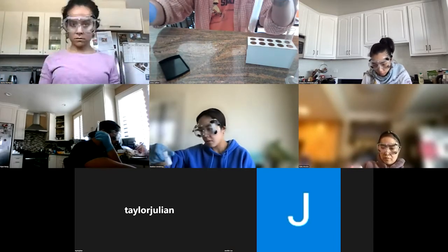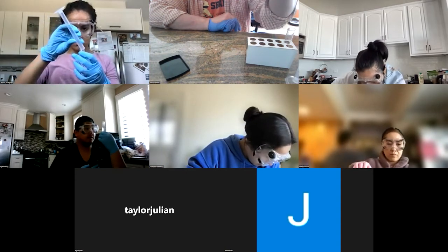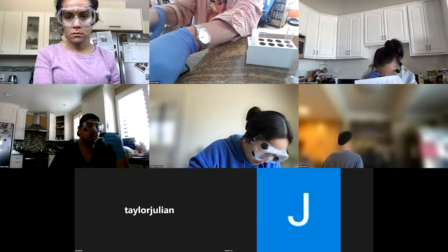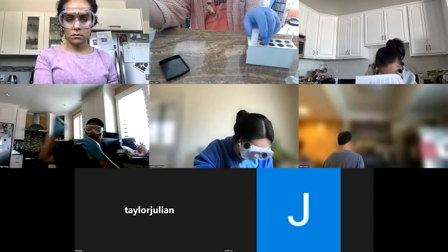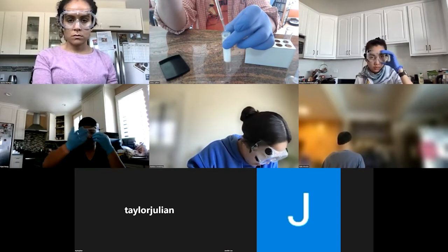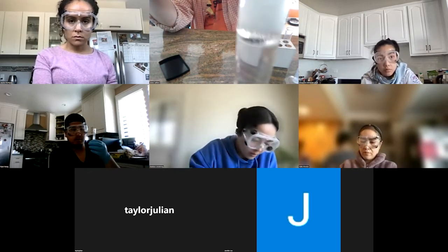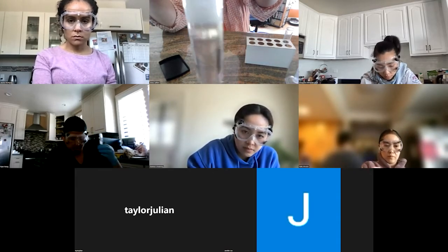And we could probably add a few more. And then you want to take a picture of that one as well. Now you can see it doesn't really look any different. I could probably put quite a bit of vegetable oil in here. There we go. Now you can see the vegetable oil clearly on the top there. I've added way too much.